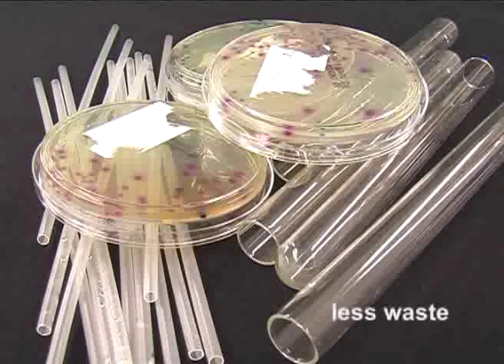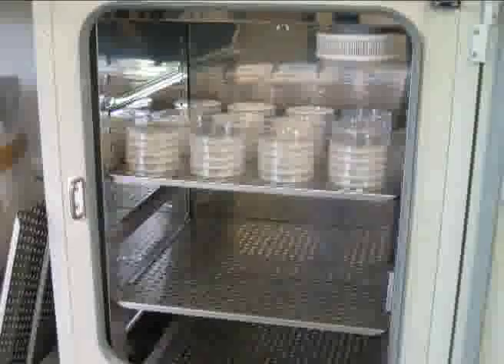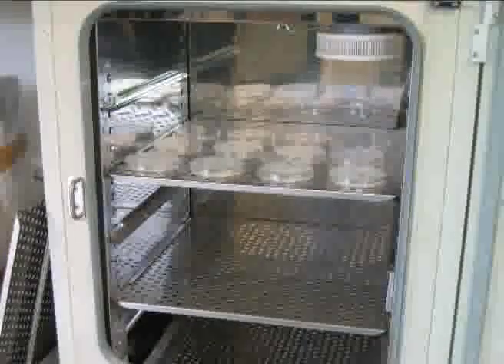No more wasted pipettes, tubes, and petri dishes. The saving in consumables, time, and space is considerable.